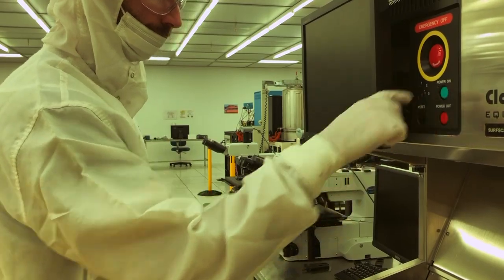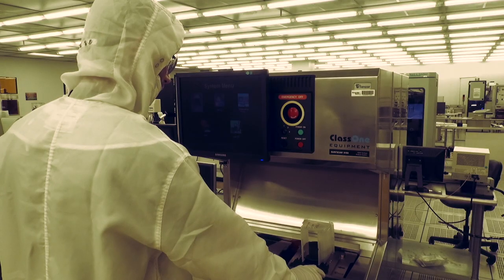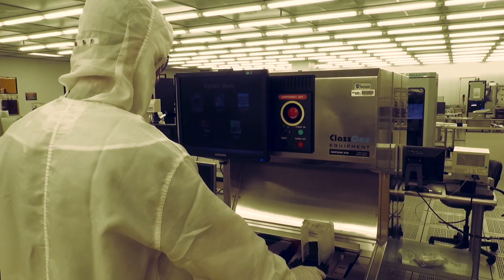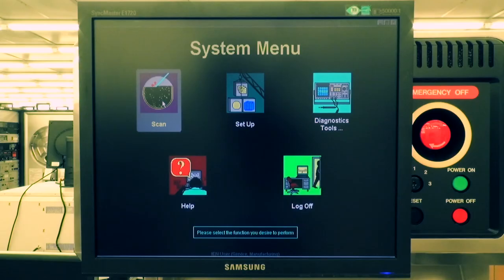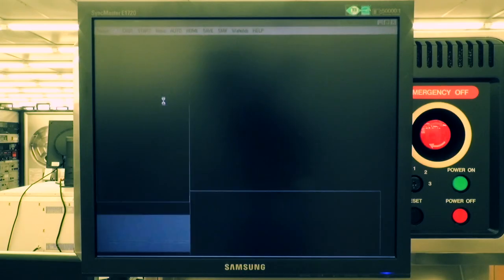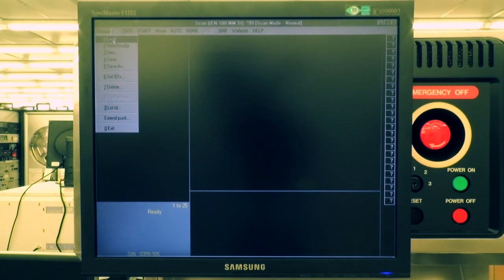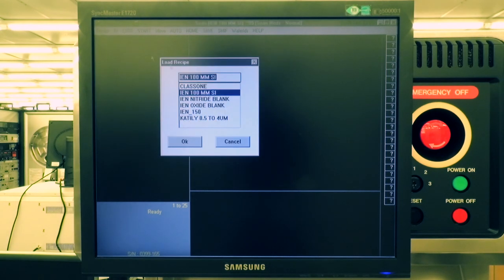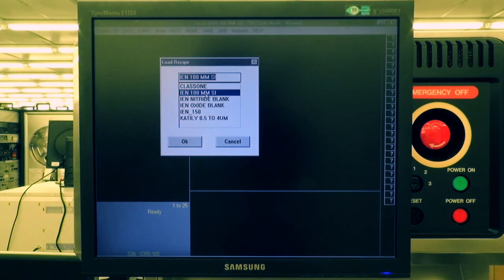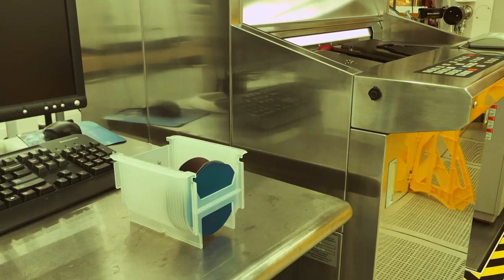On the monitor screen, click Scan and then Recipe. Choose IEN 100mm for a 100mm 4-inch silicon wafer in the Recipe drop-down tab.